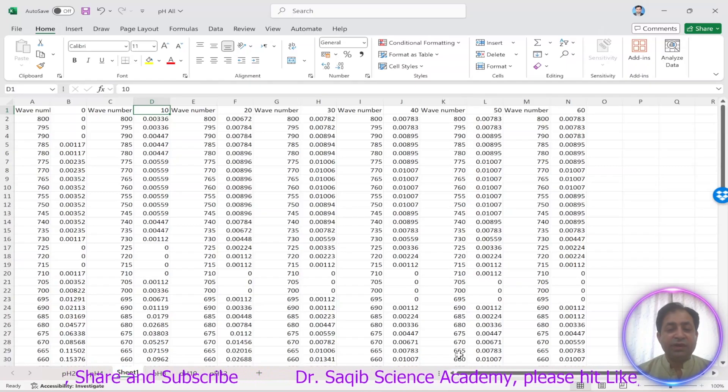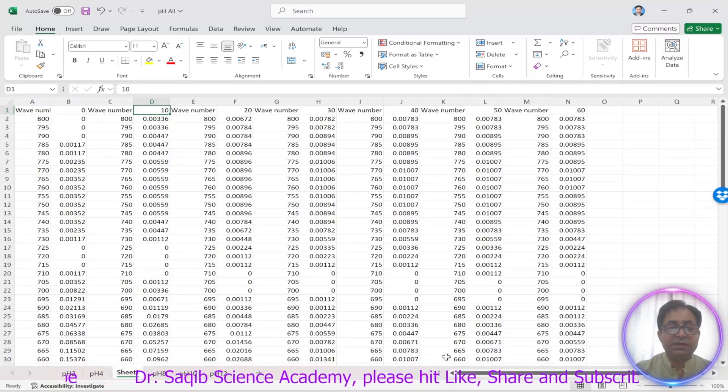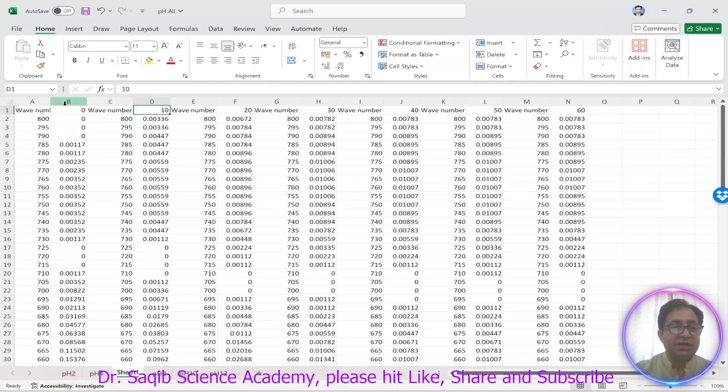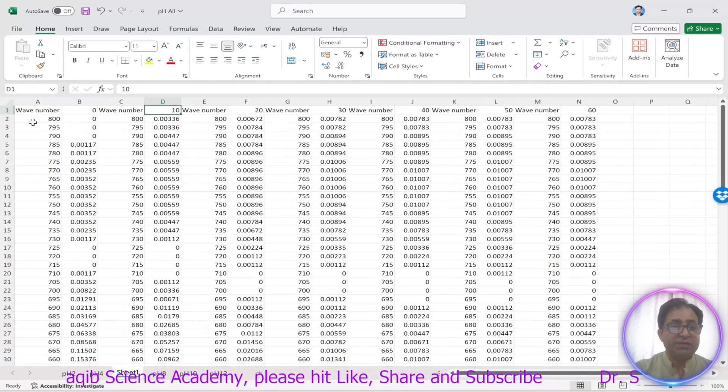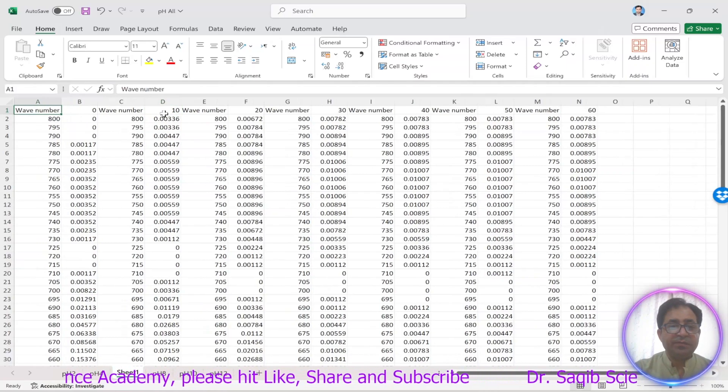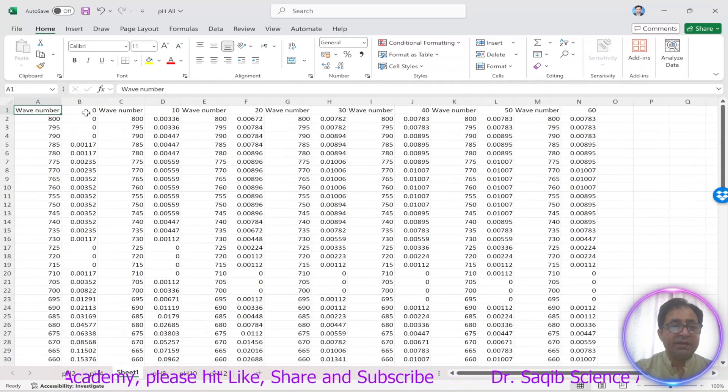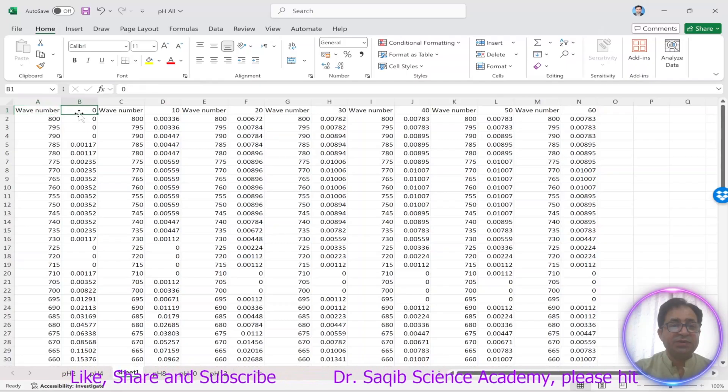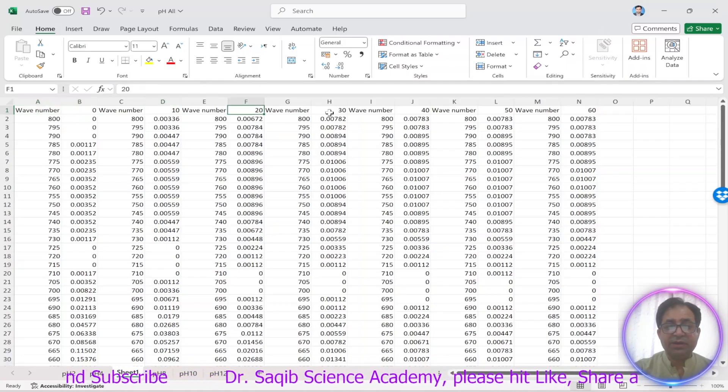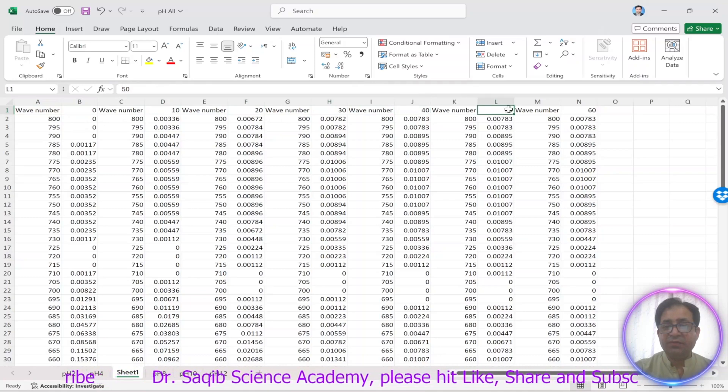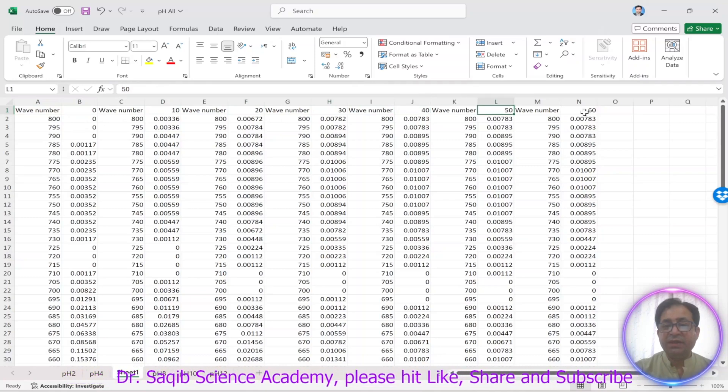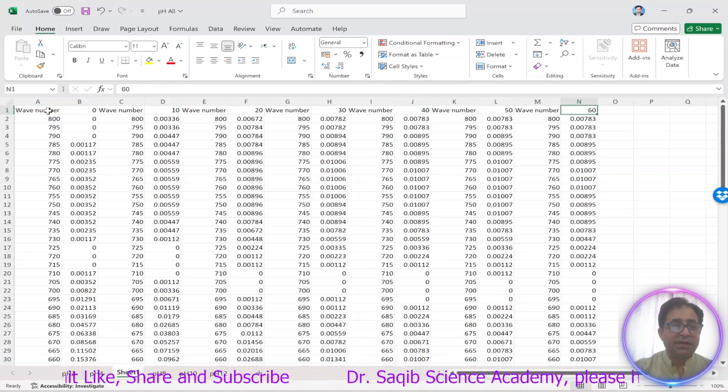So over here as you can see this is the data which we obtained from UV visible. The wavenumber and then its corresponding absorbance at 0 minute, at 10 minute, at 20 minute, 30 minute, 40 minute, 50 minute, and then at 60 minute.